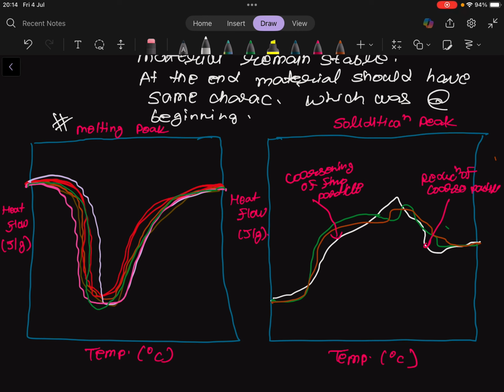It is also related to the dimension of silicon particles. So we have composite signals which spread over a wider temperature range.